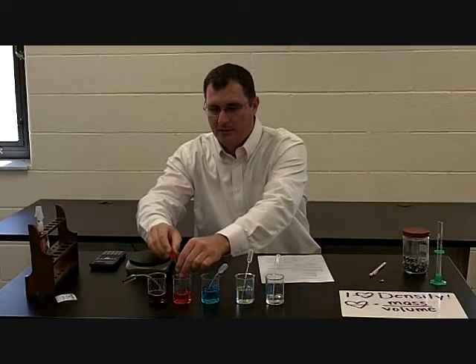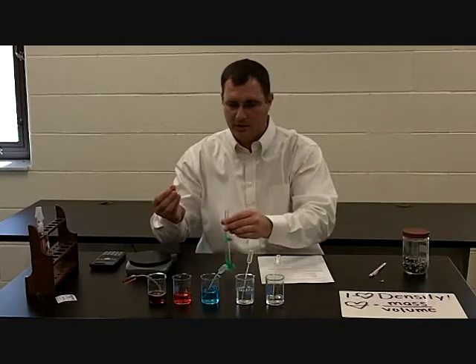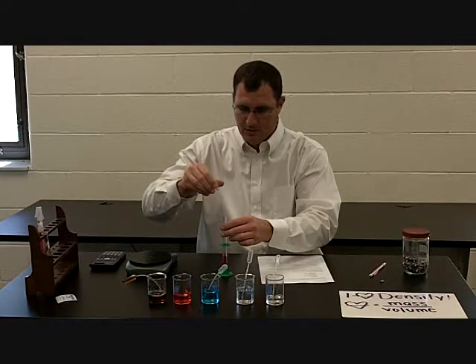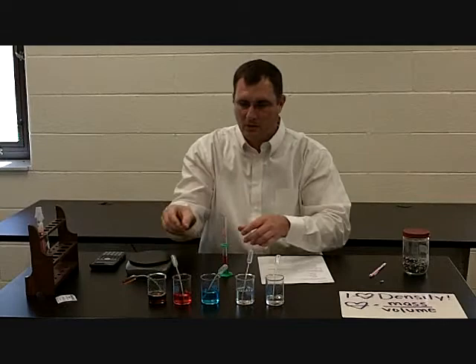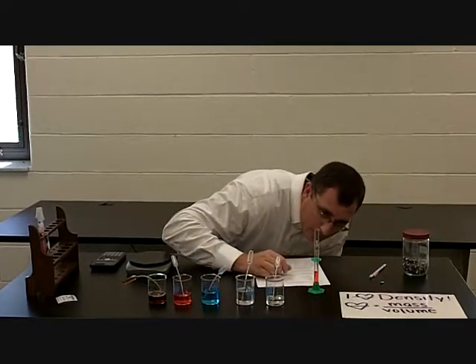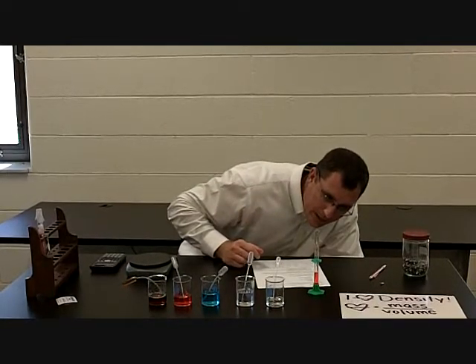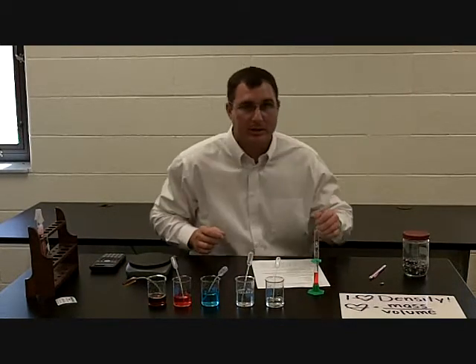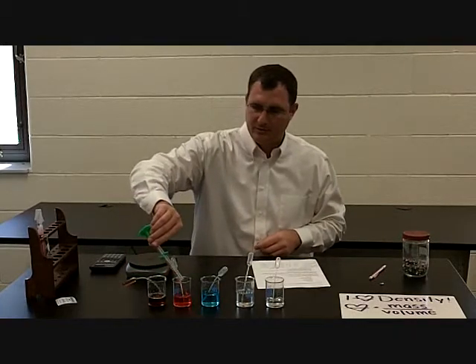and we're going to calculate the volume of liquid. So I'm going to take a graduated cylinder. Now this graduated cylinder has markings for the milliliter, so I have to estimate one spot. When I look at it really close, that is 4.8 milliliters. Okay, 4.8 milliliters. So I'm going to dump this back in here real fast.